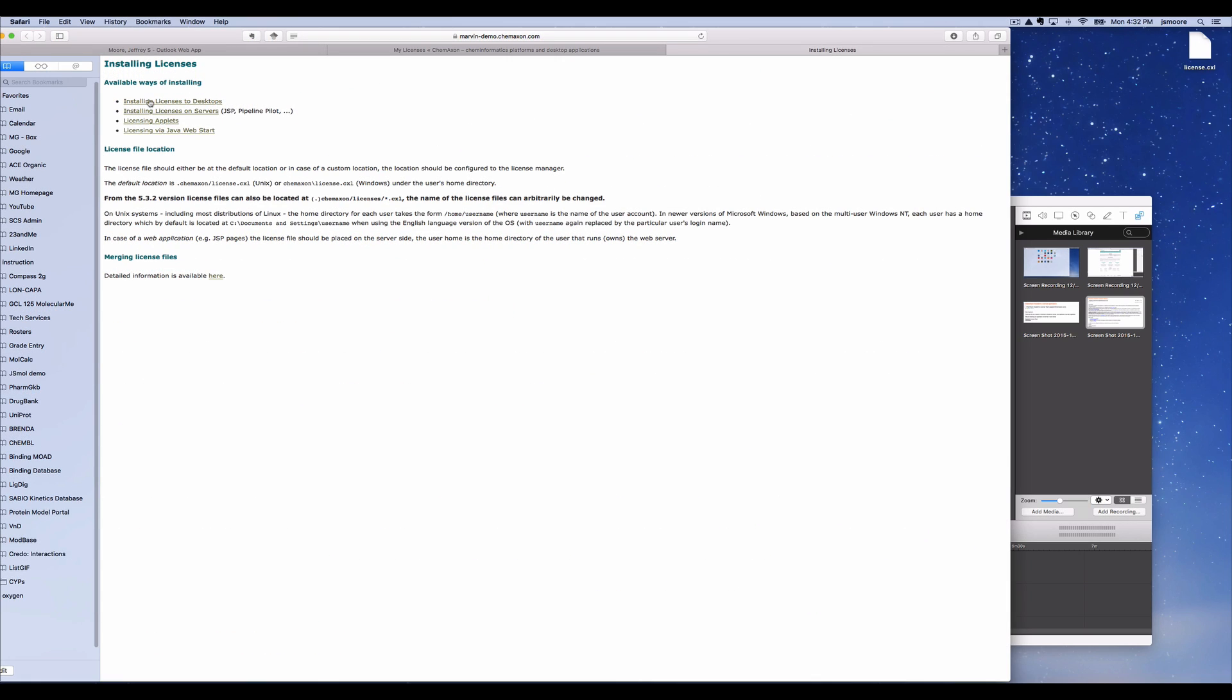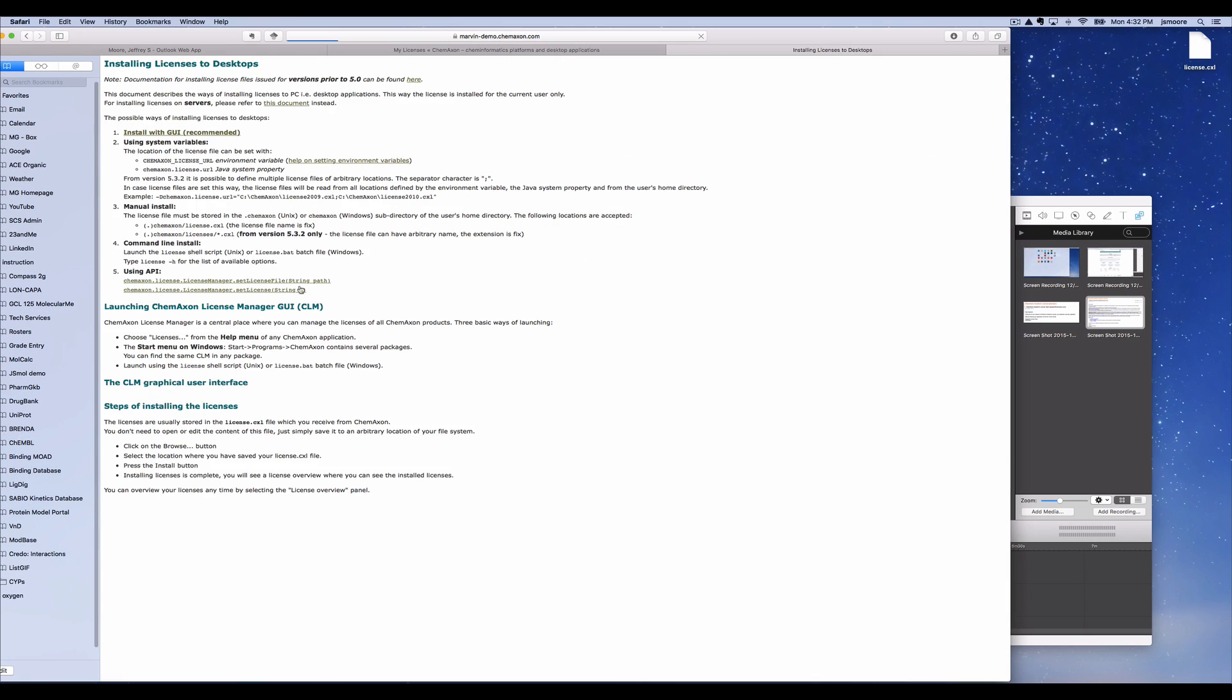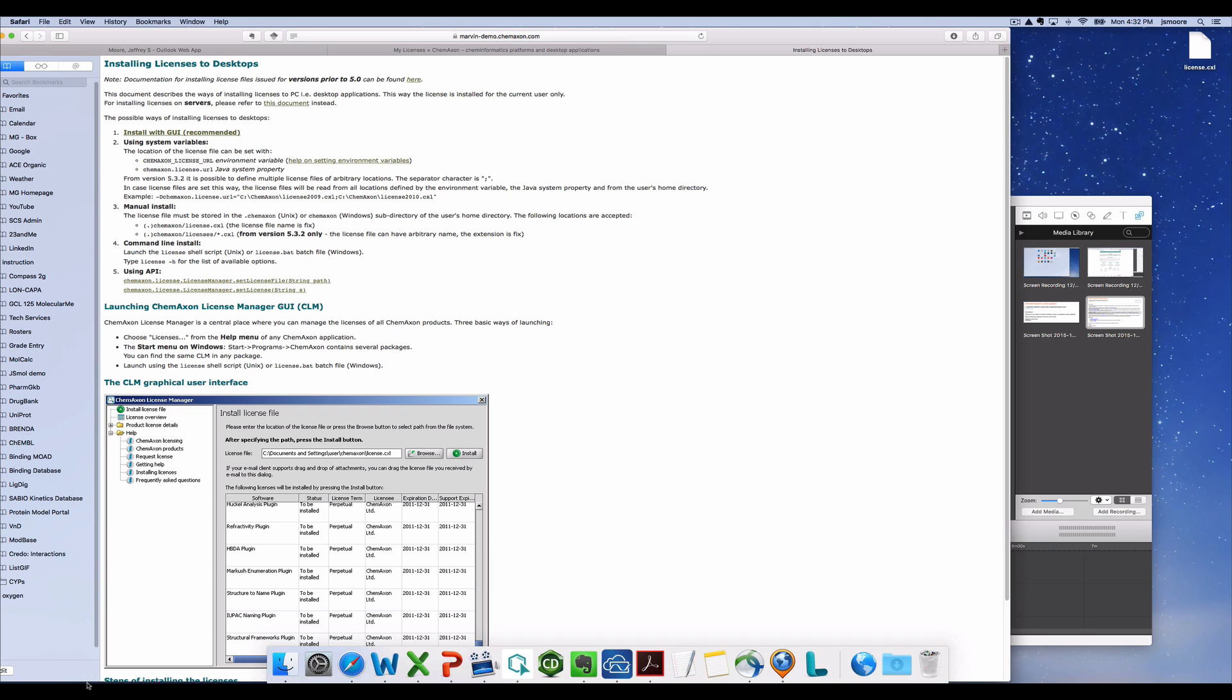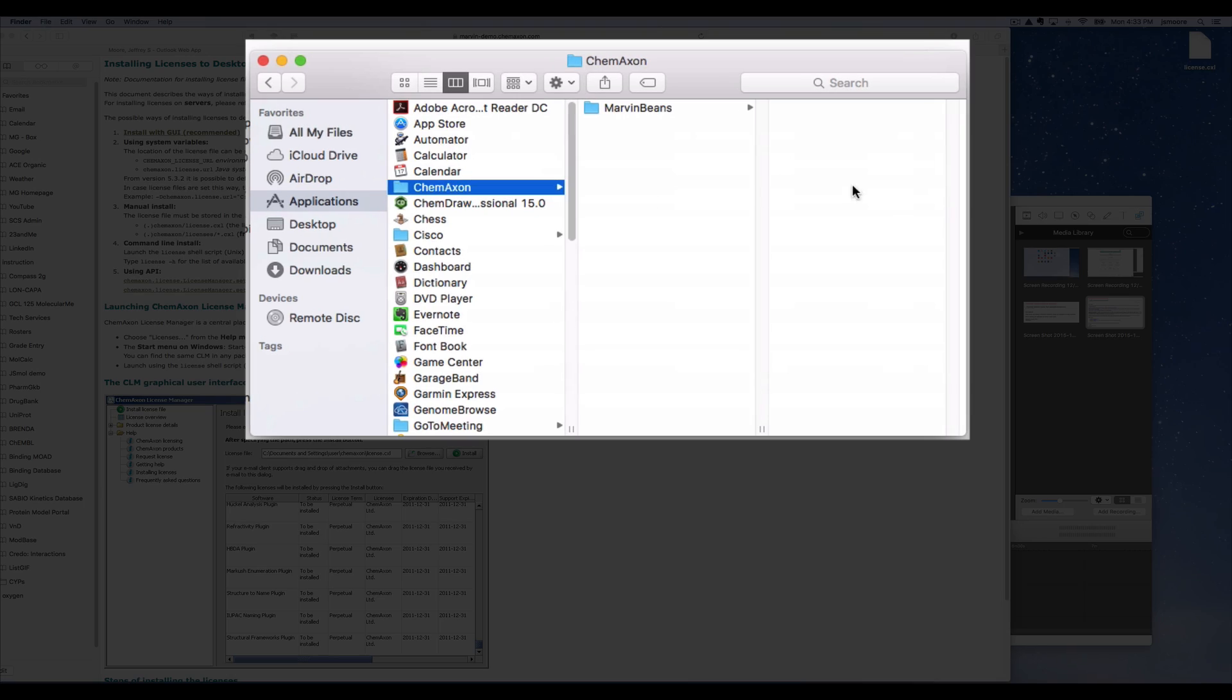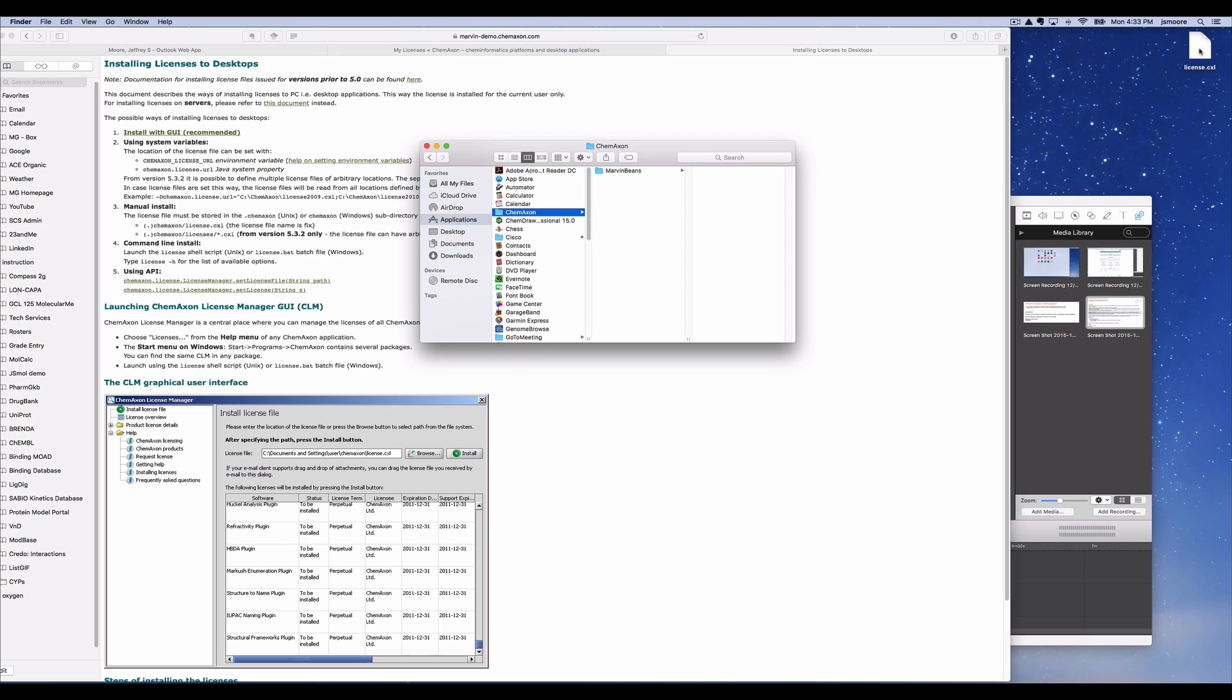Now I will demo how to install the license. I'm following the documentation on the ChemAxon webpages. Find your ChemAxon application folder. Now drag your license file into that folder.